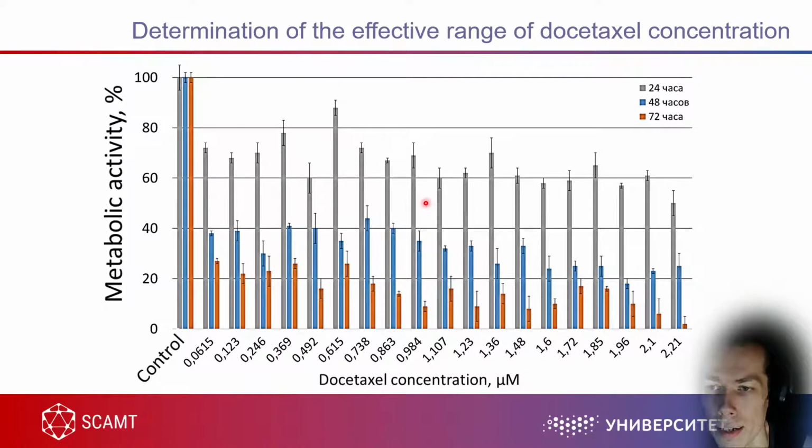So it doesn't matter how much drug you put on your cells. If no cells undergo mitosis, nothing will happen to them, because it works only during mitosis. Of course, they take up a lot of the drug inside, but it doesn't matter because it's not working until they undergo division. And this division occurs simultaneously in some cells because, well, some cells are dying maybe from other reasons. And because this culture is synchronized, they die almost simultaneously, and this looks like stages.